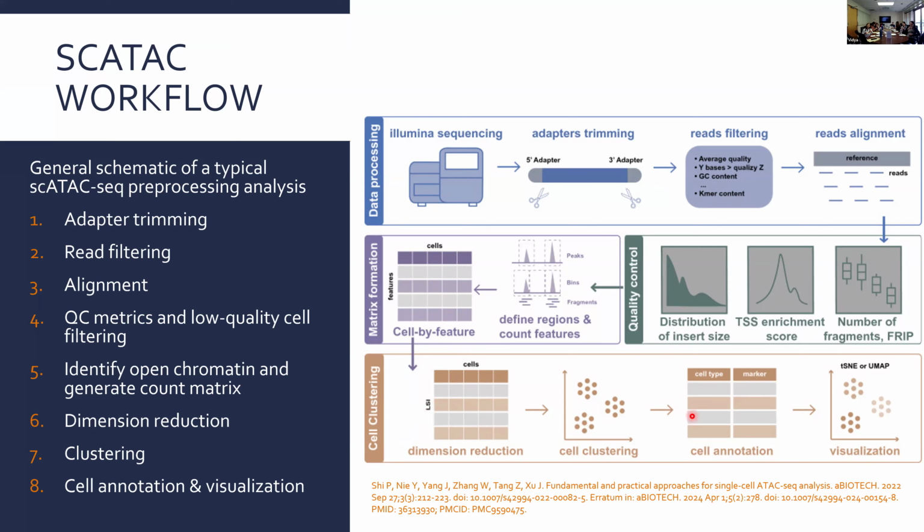And then a little more challenging part with pure single-cell ATAC-seq data is annotating those cells because you don't have gene expression. But because you have the accessibility information, you can generate a proxy gene expression score called a gene score.